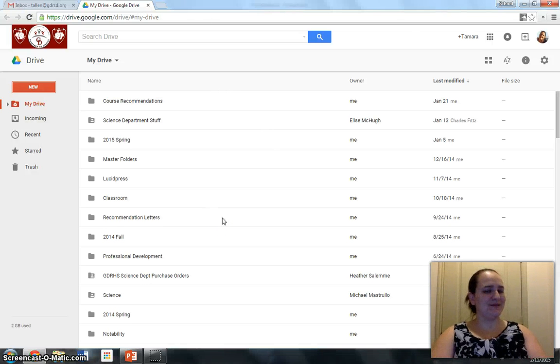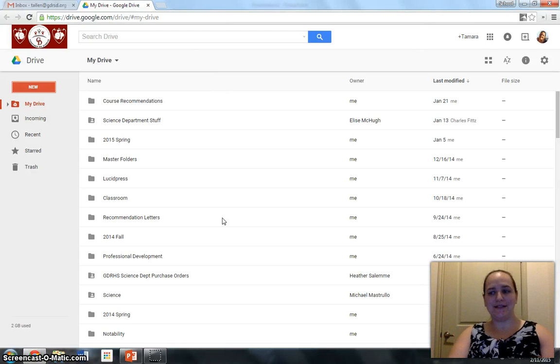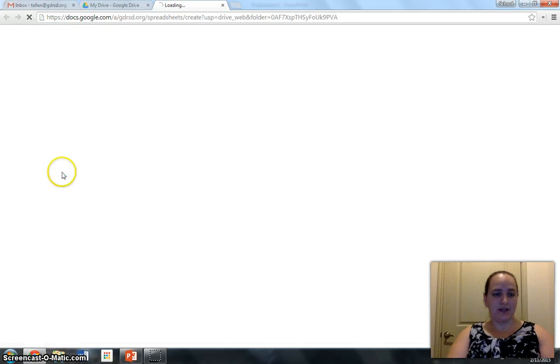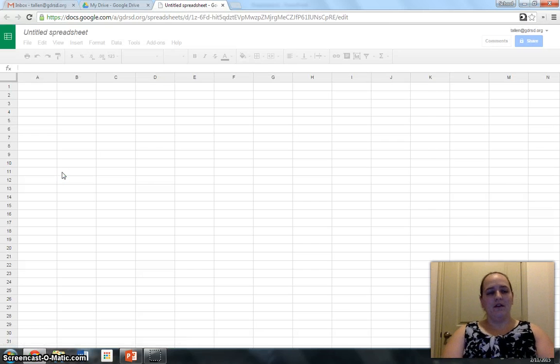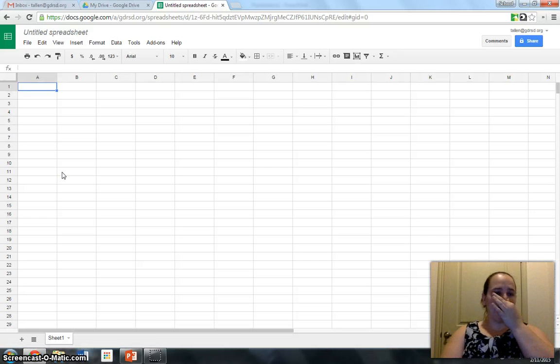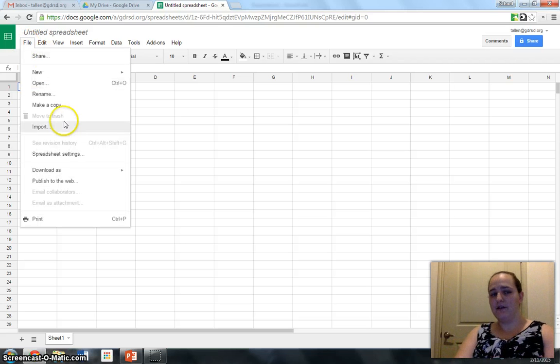Hi guys, so today I'm going to show you how to do the data analysis for the kinetics lab that we just did. So the first thing you need to do is go into your Google Drive and get yourself a shiny new spreadsheet. So from here, once this does its thing, we need to import your CSV file. So import that data file that you saved from the laptops in the lab.